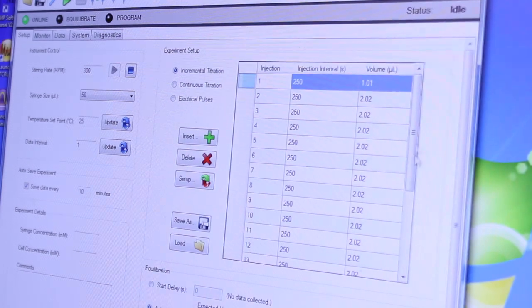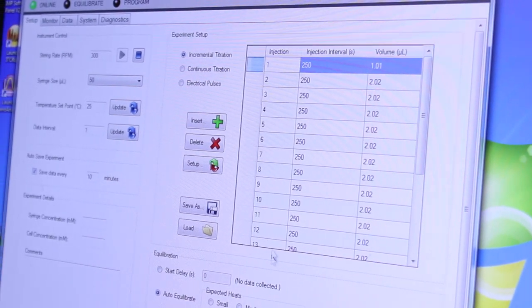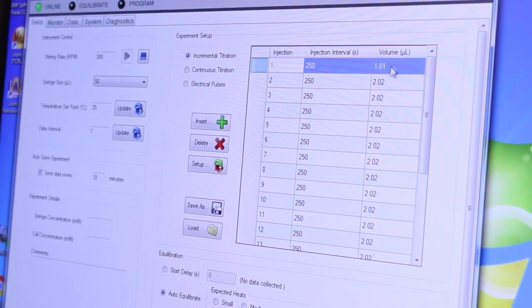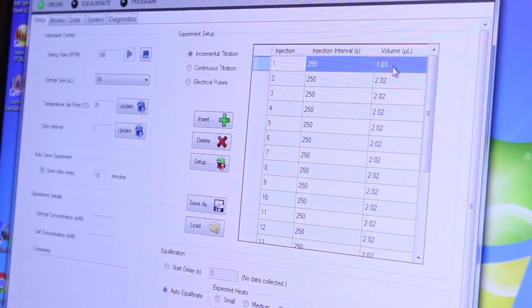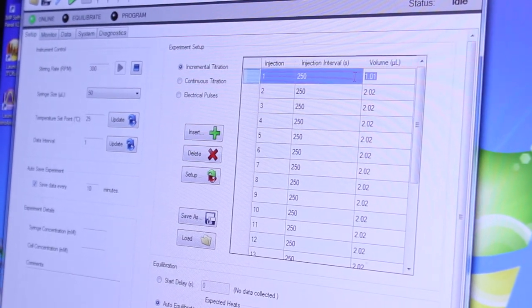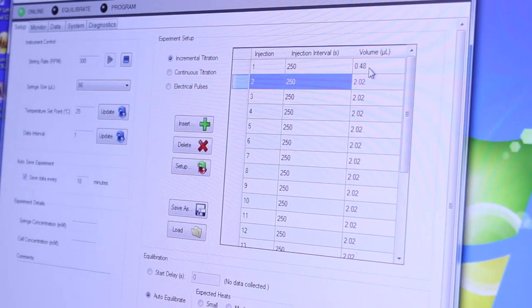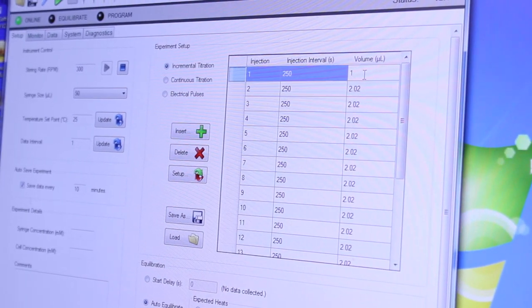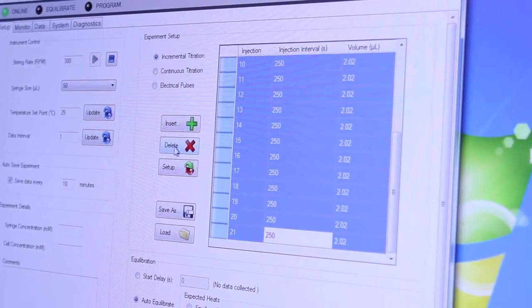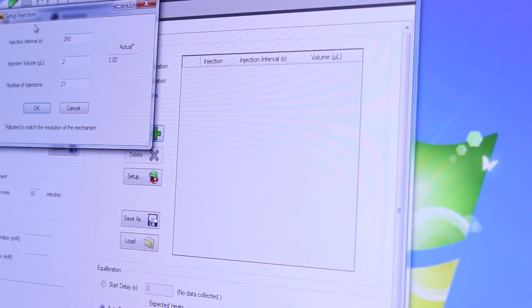Certain experiments may require a different stirring rate just type in the number here and then click start and you should hear the syringe start stirring during this equilibration period it's good idea to set up the titration protocol for our experiment. This table here lists the number of injections the time between each injection in seconds and the volume to be injected. The table can be edited by hand if you wish it will adjust the number to match the resolution of the instrument.